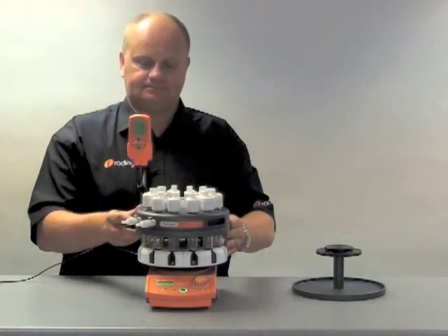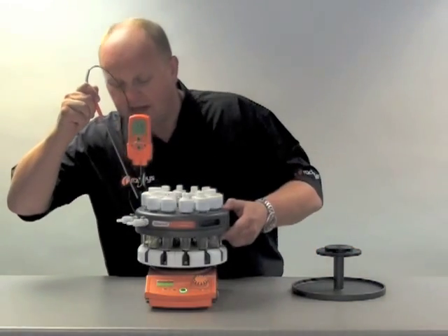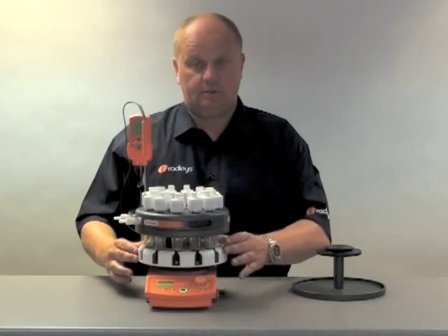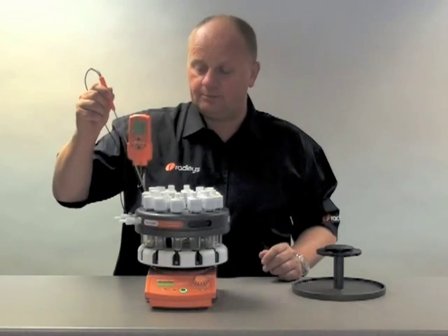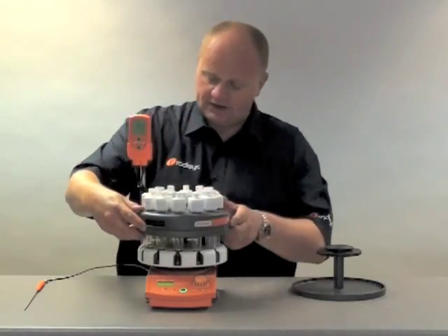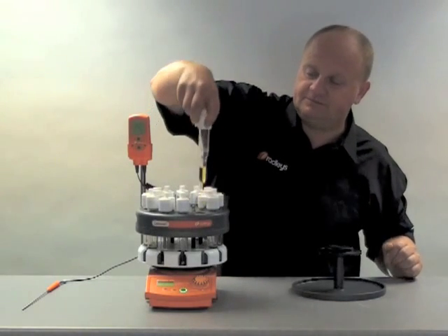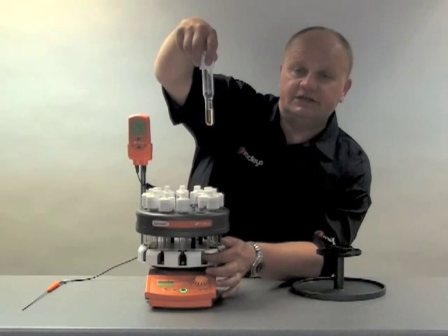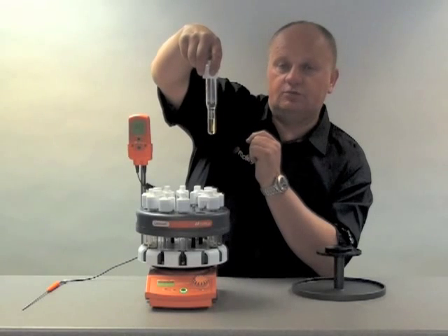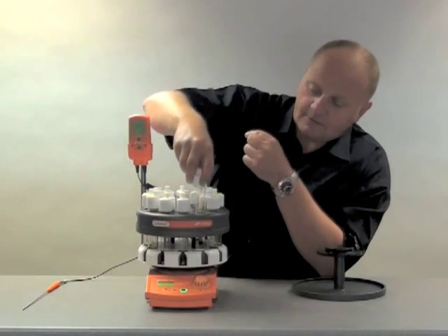Now, we have the temperature probe. The temperature probe can either go in through a hole in the top into the base, controlled by the block temperature, or we can put it through one of the sceptres and control by solution temperature. Round this side here, you can see we have one of our reduced volume tubes. In there there is a removable insert — you can have one in each of the twelve positions or as you like. And this reduces the volume of the tube down to one ml, so you could use this tube down to one ml volume.